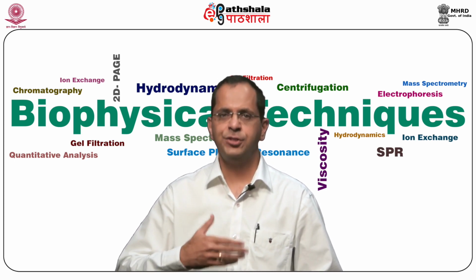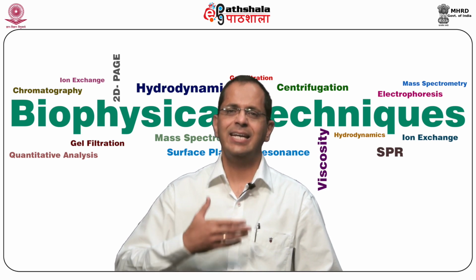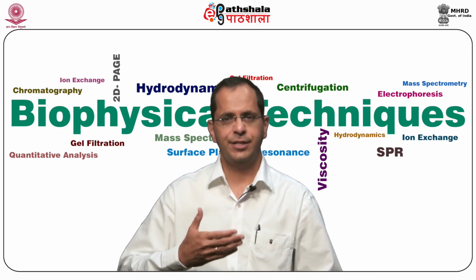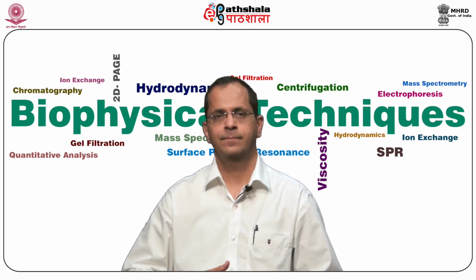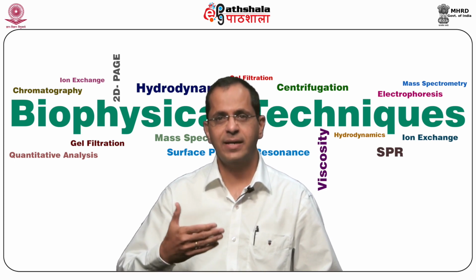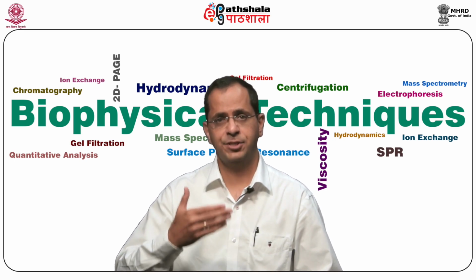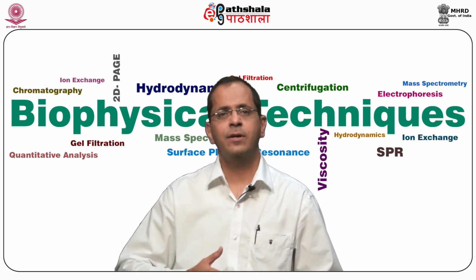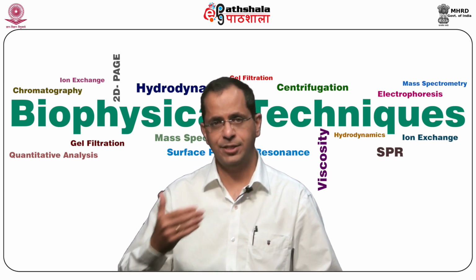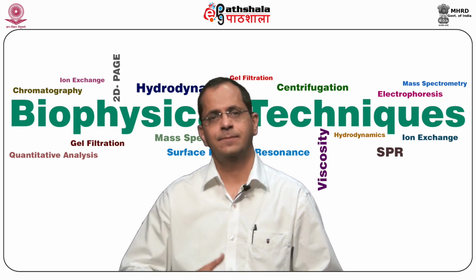Labeled proteins are visualized using a Typhoon Trio variable mode imager by scanning the cyanine 2, cyanine 3 and cyanine 5 images at different excitation wavelengths and emission filters. These gel images are then taken to a particular software that allows relative quantification of expression, consistency of expression pattern across a certain number of biological replicates, and normalization by co-detection of image pairs which are intrinsically linked to a sample and its in-gel standards.